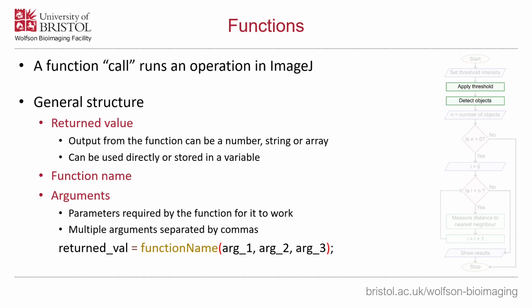Now, in much the same way that a variable allows you to store data in a way that you could call it back without having to write it down each time, a function stores an operation with just a short keyword. And we've seen these previously: the print statement, the new array statement, and then also that array.show function. So the general format of a function is shown here.